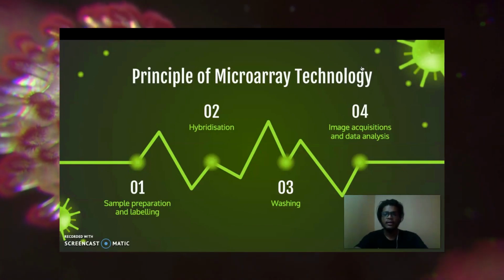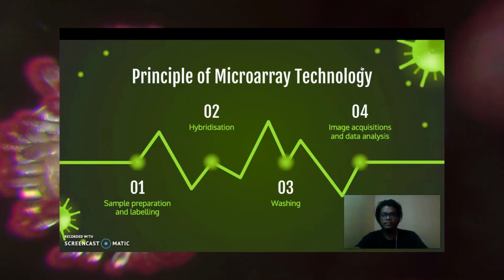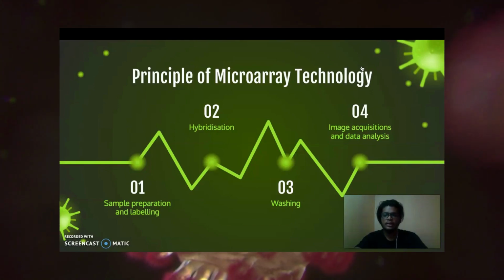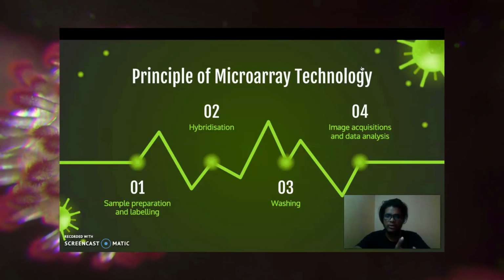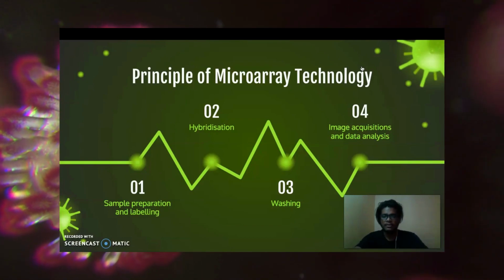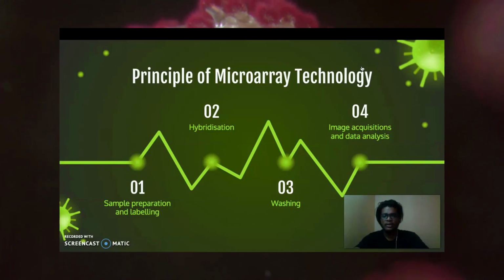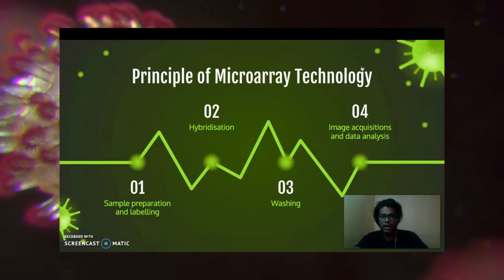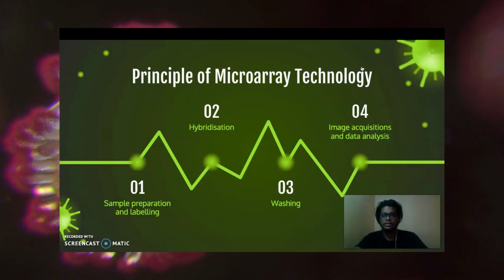The remaining DNA fragments are washed away. The target DNA pieces can be identified by the fluorescent emission from a passing laser beam. A computer is used to record the pattern of fluorescent emission and DNA identification. This technique of employing a DNA chip is very rapid, besides being sensitive and specific for the identification of several DNA fragments simultaneously.